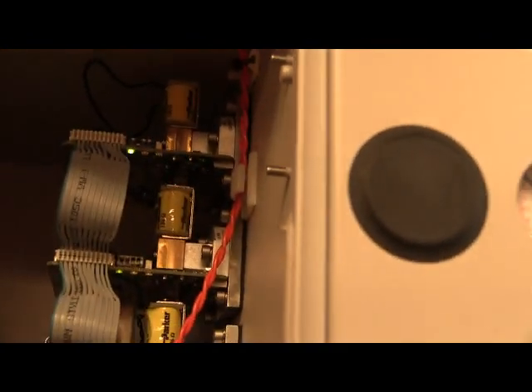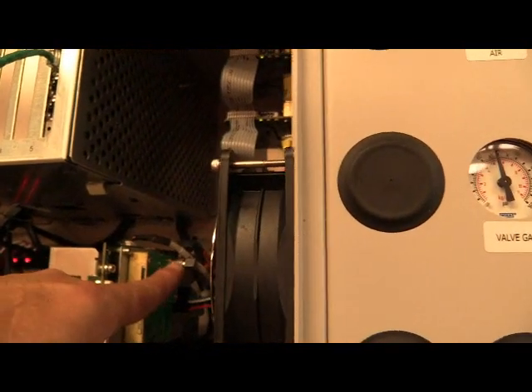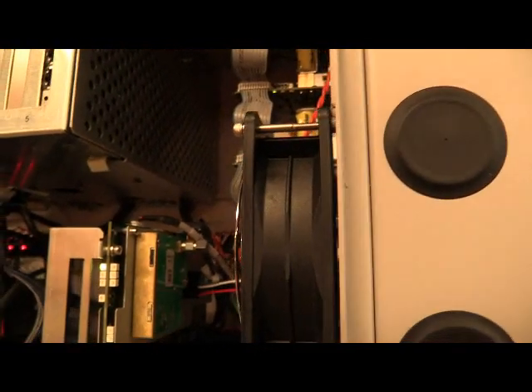Because they have to know who they are. They're all daisy chained together. And all those wires are basically the same. So now you have to be able to identify them one from the other. Our next DPM, detector personality module, is for an FID, flame ionization detector.